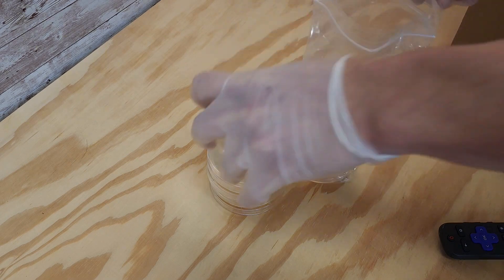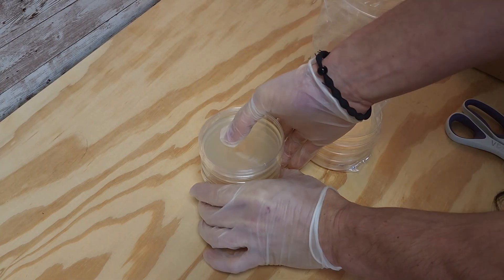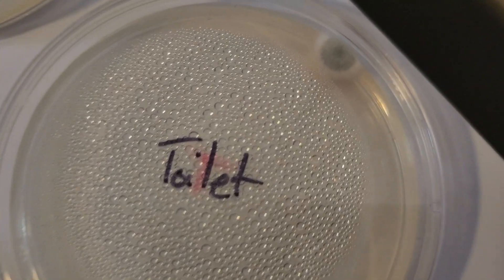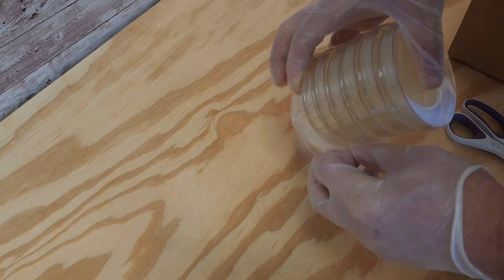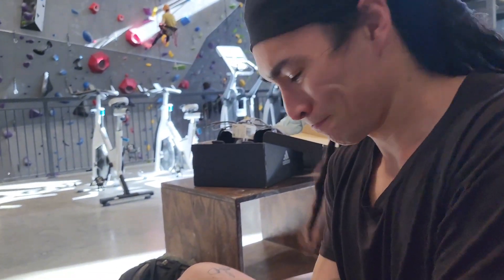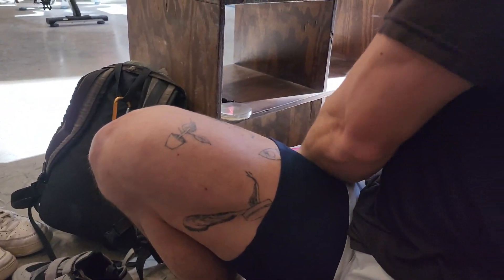Disclaimer: we do grow some nasty stuff. Here's just a sample of some things that we are going to grow — gross. Now we're packed up and ready to go to the climbing gym.